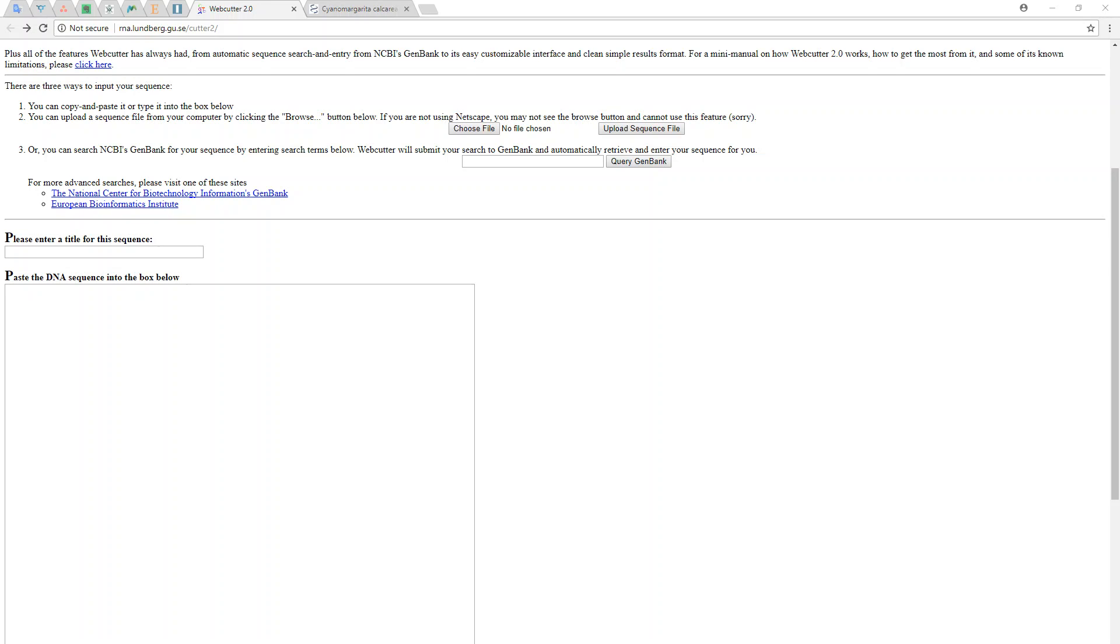Hello everyone, today I want to make a short video about how to work with digests and how to understand them. Basically we do ligation and insert our PCR products into a plasmid, then import these into E.coli and clone. To check if you've inserted your products into the plasmid, you need to cut your piece from the plasmid using restriction enzymes.